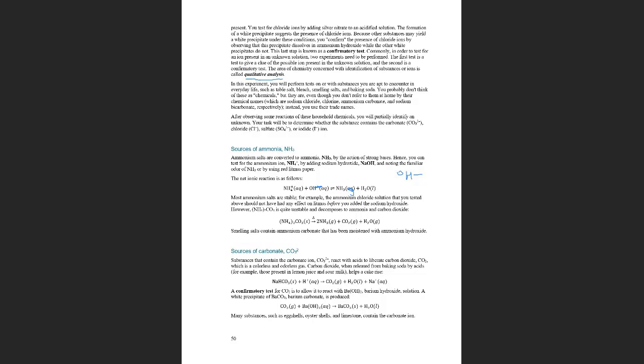So the first reaction, we are going to test ammonia. This is ammonia. Here they are presenting which reactions you are going to do in the lab in order to identify ammonia. Because we are not doing it, this is a virtual lab, all the data will be given to you on the first page. In red, you will see all the answers that you were supposed to obtain.